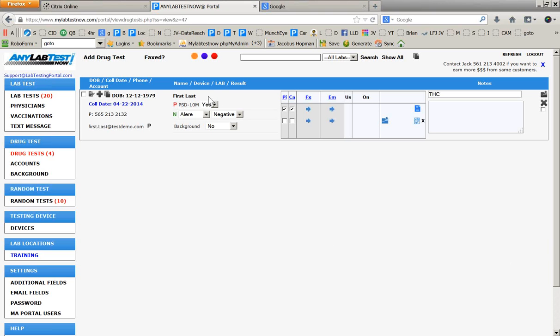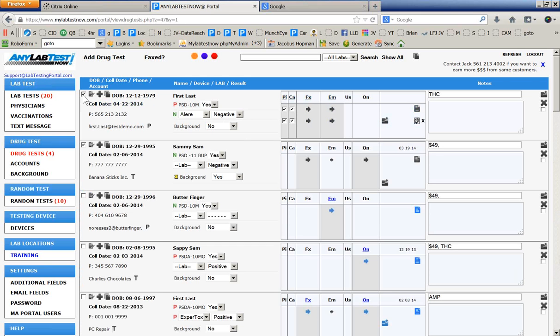So you see here, let's assume, once you're done, you say you have fax and you have email. You want to make sure, and that is one of the most common things I see MAs forgetting: once it's done, you want to check this box. This box means everything is done. All the colors are turning black.